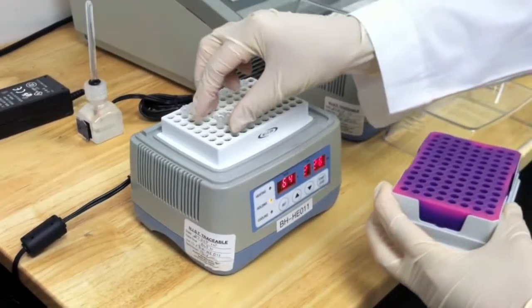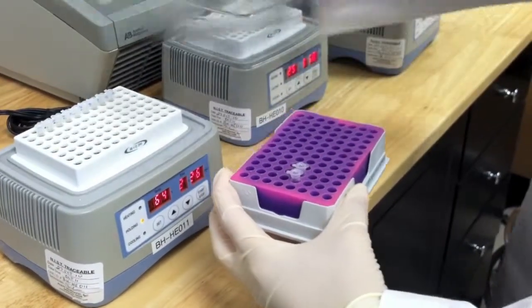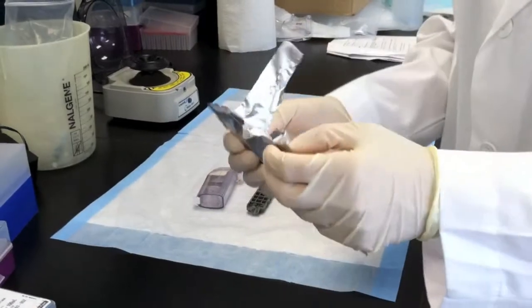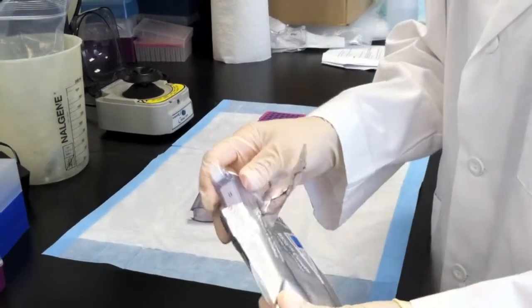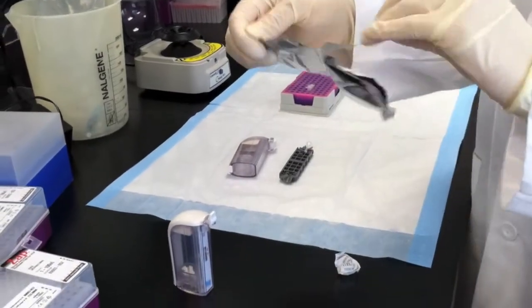Remove the reaction tubes from 64 degrees Celsius after 60 minutes. Take the number of cassette packages, one for each reaction, out of the kit. Tear open a new cassette package.